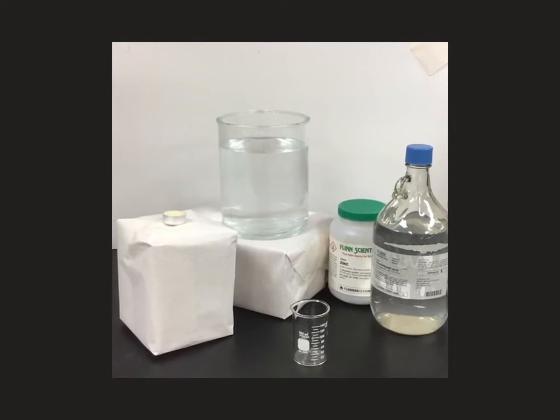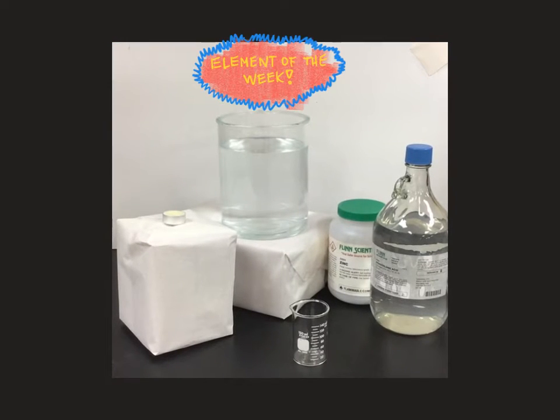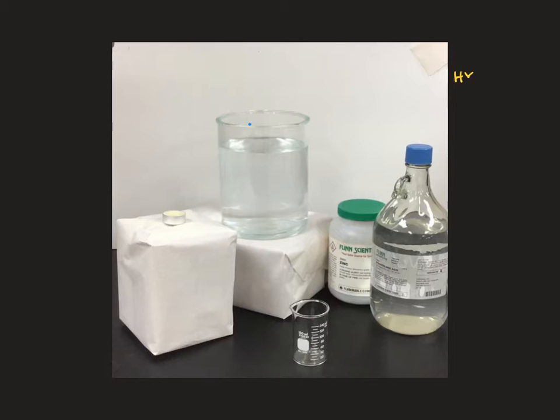All right, ladies and gentlemen, it is time for Element of the Week. For this week's Element of the Week, we are going to be doing a demonstration we like to call hydrogen bubbles. Have a look at the materials which we've gathered here.